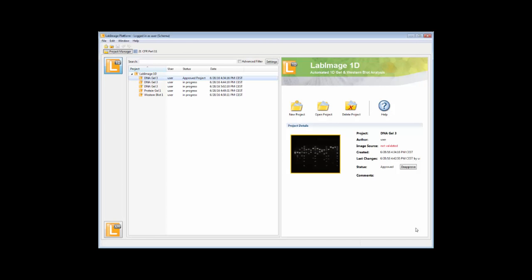Now we're in, indicated by a logged in user. For those who know LabImage1D and its very intuitive user interface, nothing is really new.